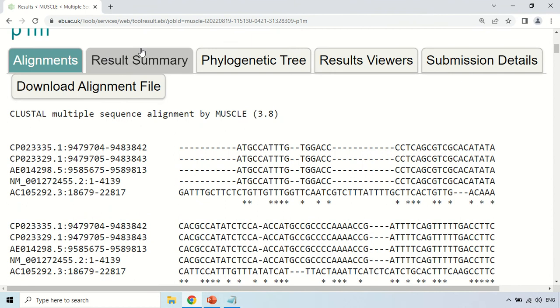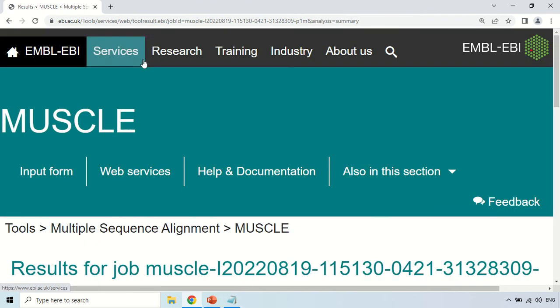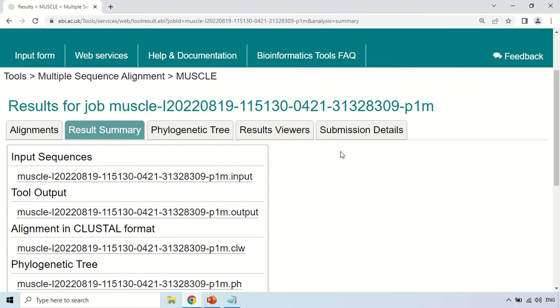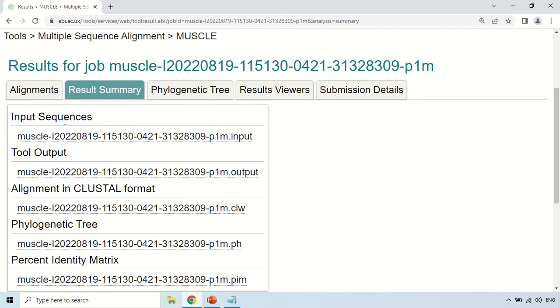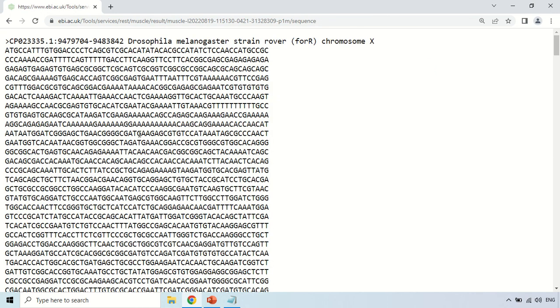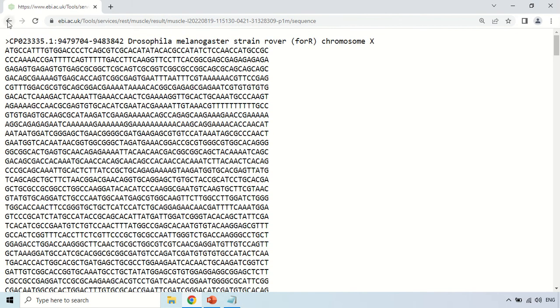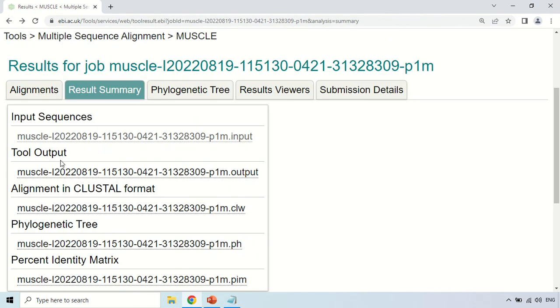Now, under the Result Summary tab, if you click here, you will find the result summary. Under the Result Summary, you can see the input section — these are the input sequences. If you click there, you will see the sequences which you gave to the tool for performing multiple sequence alignment. Under output, it will show you the alignment results in ClustalW format.